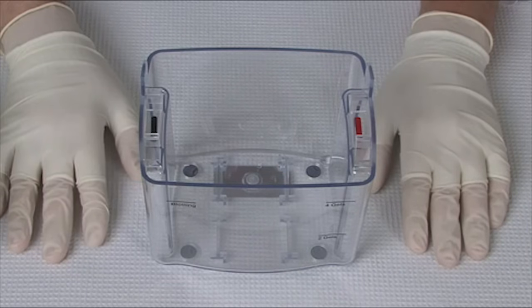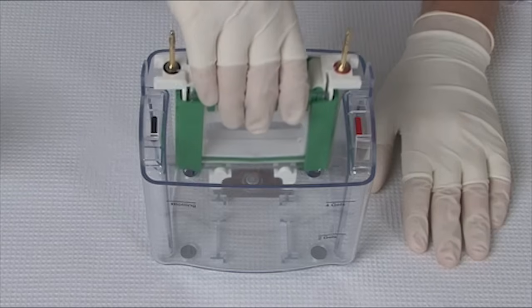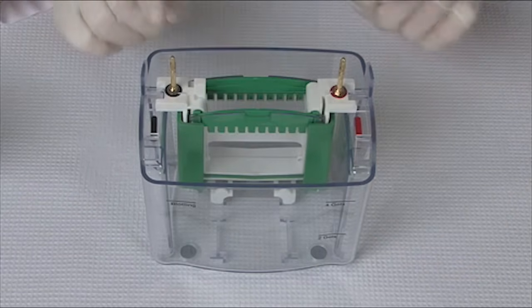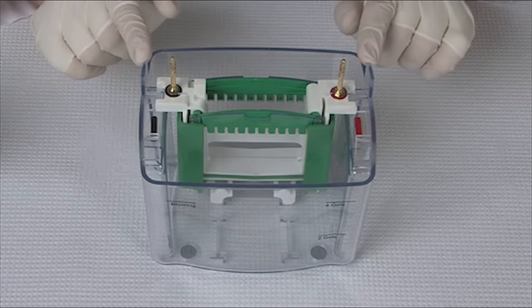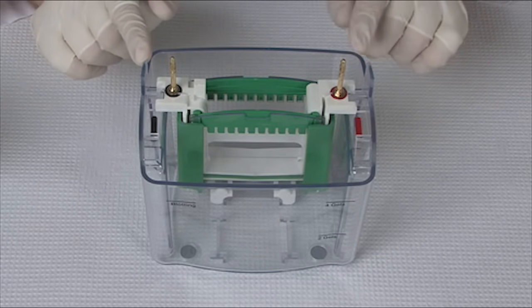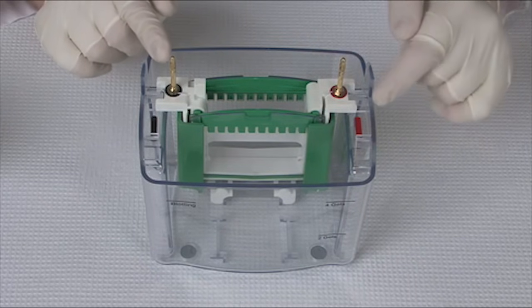To begin assembling the MiniProtein TetraCell, take the electrode assembly module and place it in the TetraCell tank. It is important to align the banana plugs on the electrode module with the tabs on the tank, and make sure that the red marking that designates the anode lines up with the red hatch mark on the TetraCell tank.